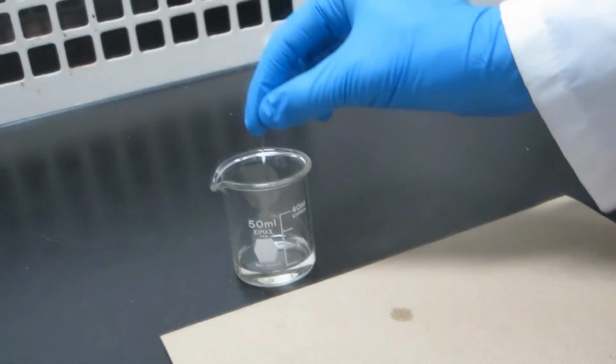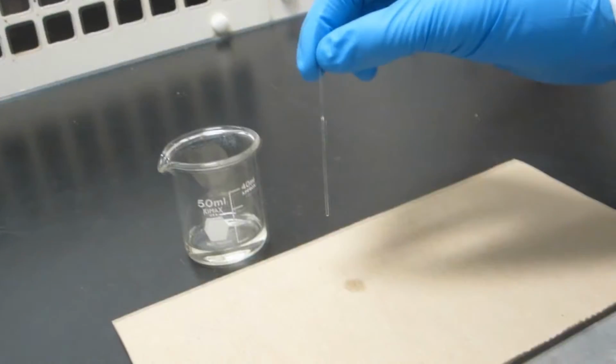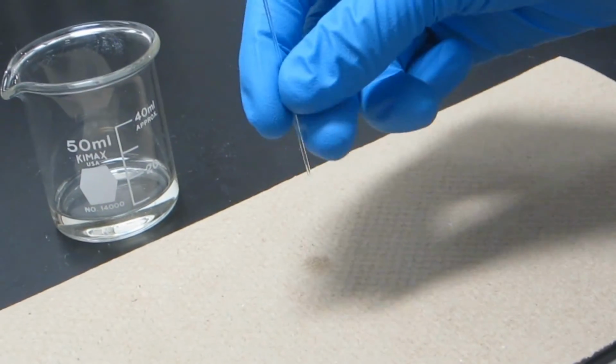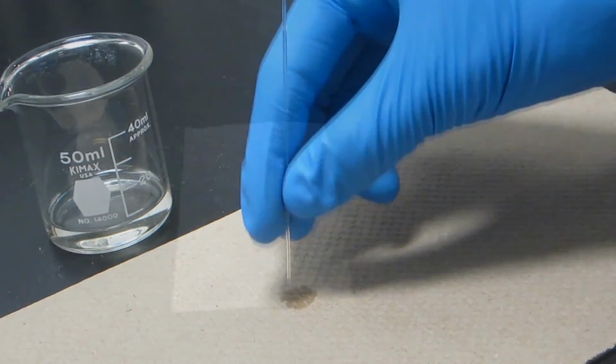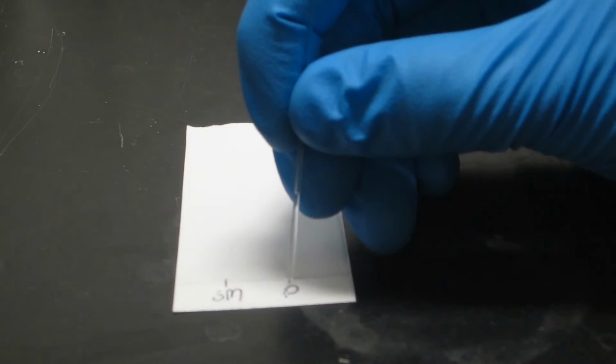This can be done by dipping the spotter into clean solvent, such as acetone, and depositing the solvent onto a paper towel. Do this 2 to 3 times before spotting your next sample on your plate.